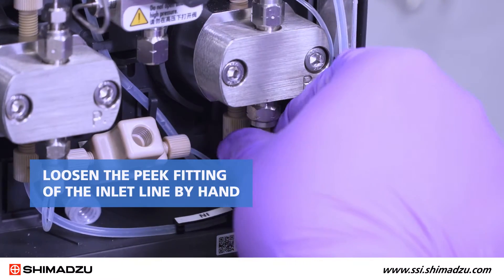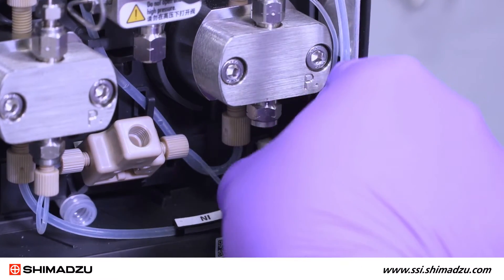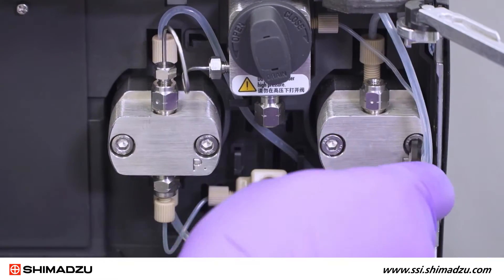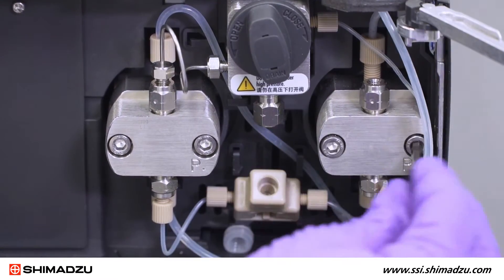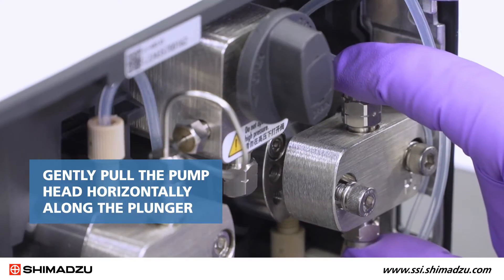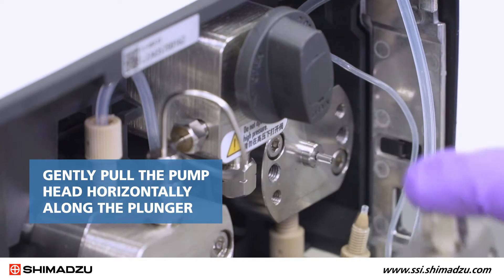Loosen the peak fitting of the inlet line by hand and remove it from the inlet check valve. Now you can remove the pump head. Gradually loosen the two hexagonal socket screws using the Allen wrench and gently pull the pump head horizontally along the plunger.